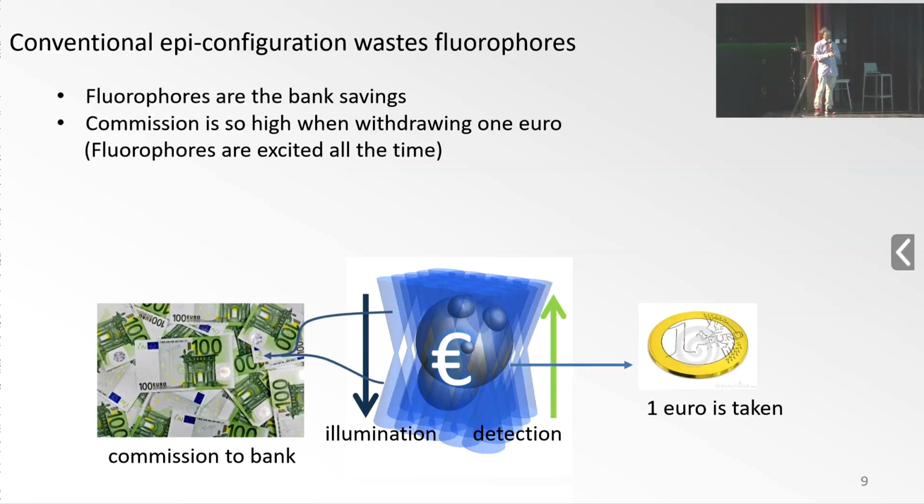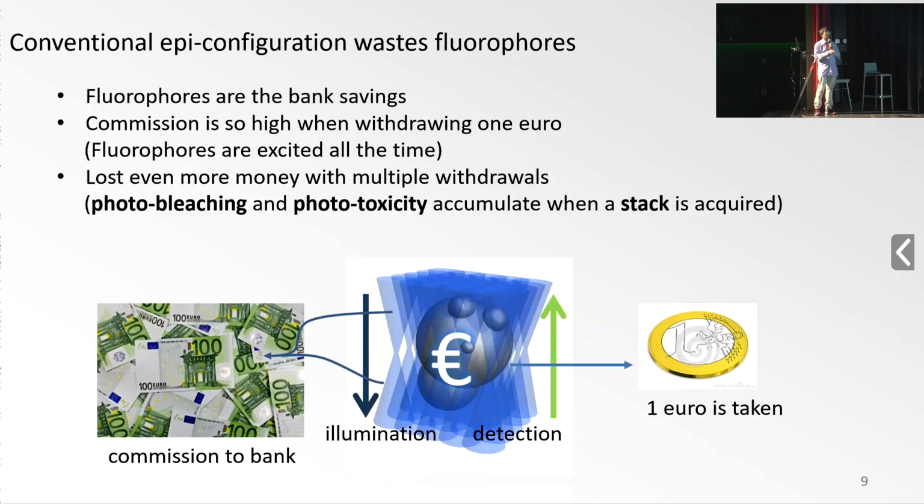And if you want to take a 3D stack, you have to go through each plane here. Every time you take €1, you actually pay more to the bank. So I think no one wants to do that unless you work in a bank, and I guess no one here works in a bank.